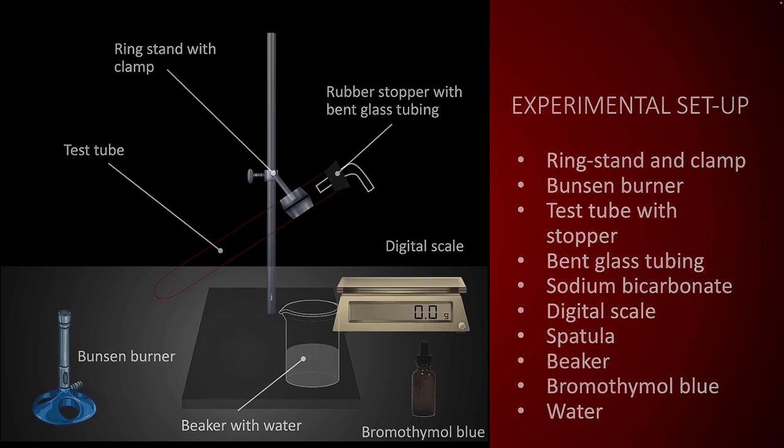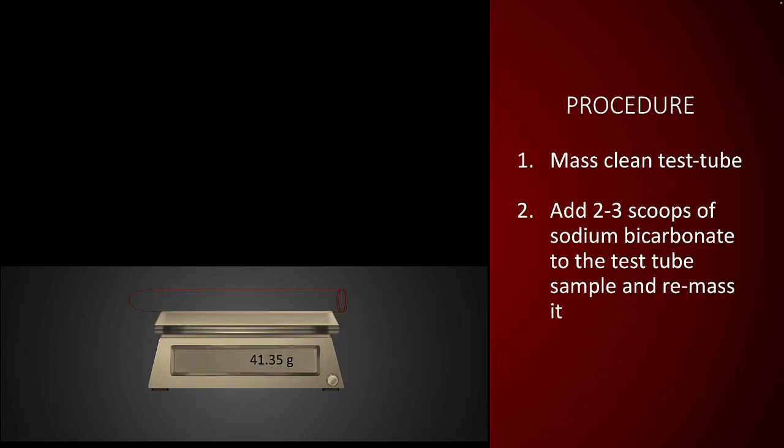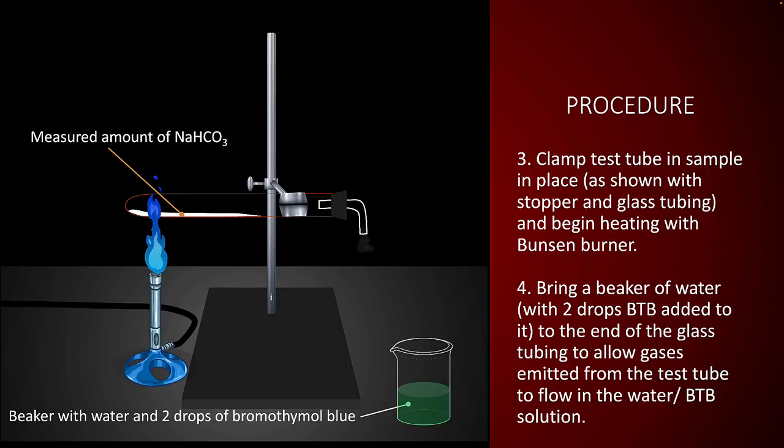The first step is weighing an empty test tube and then adding 2 to 3 scoops of sodium bicarbonate and weighing the test tube and contents again. You'll assemble the equipment as shown, which involves first inserting the stopper and bent glass tubing into the mouth of the test tube and then clamping the test tube in place as shown, making sure the bicarbonate is spread thinly along the length of the test tube.